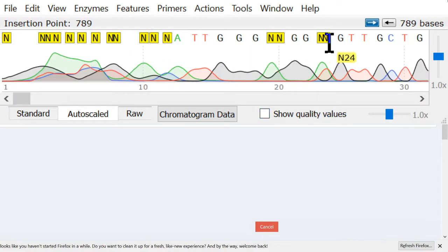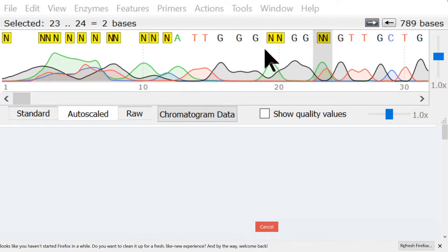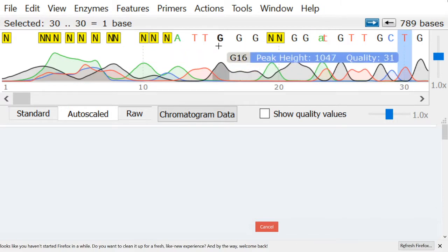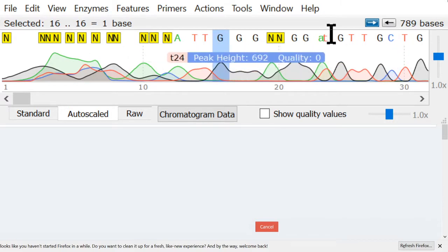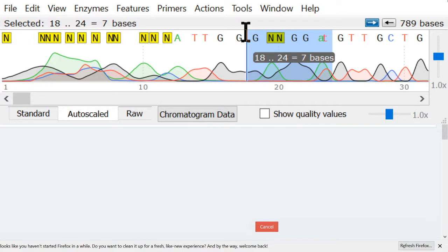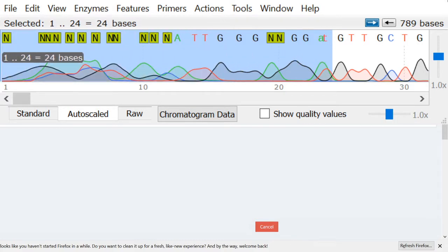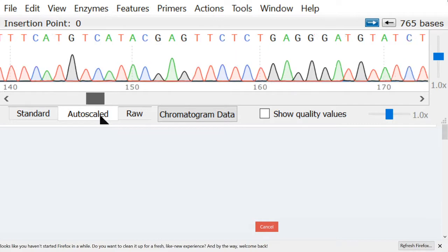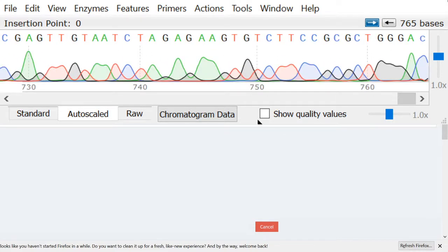And here are a couple of ends, and I can see that this is an A and a T. So I will fix these. I could also just chop it there. That'd be fine too. In fact, I think I will chop it because this is another conserved region and there's really no reason to guess and maybe get data that's not solid. So I'll delete off of that end. And now we have all this really good solid data in the middle.